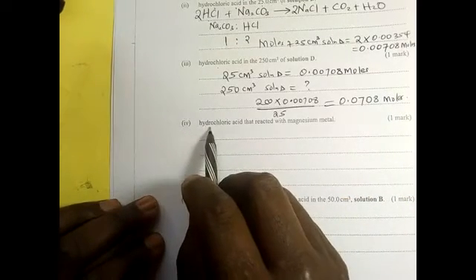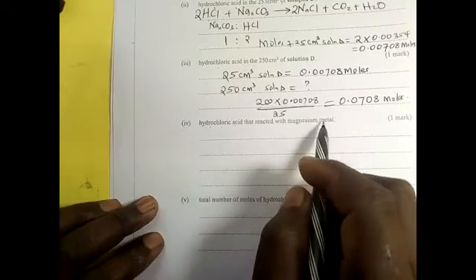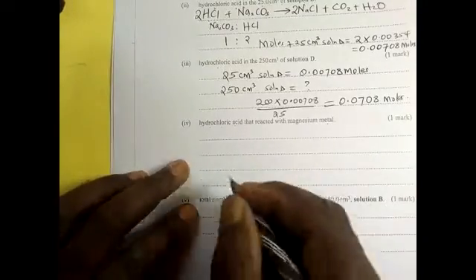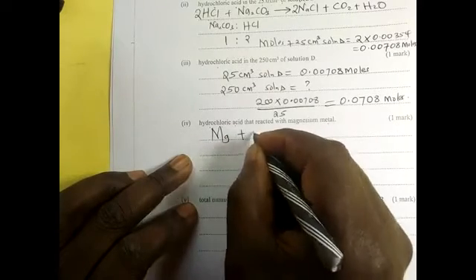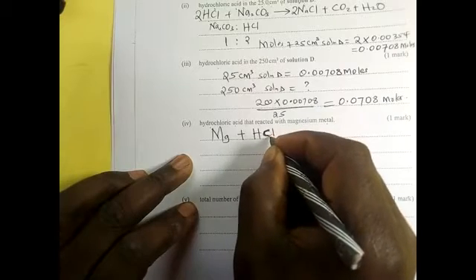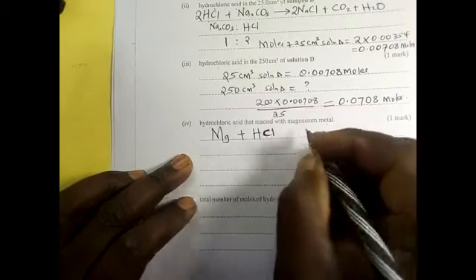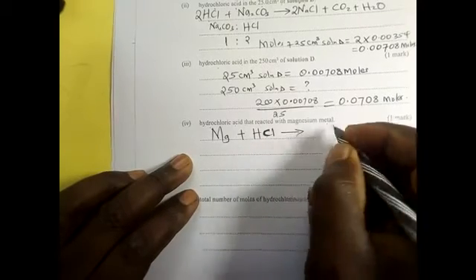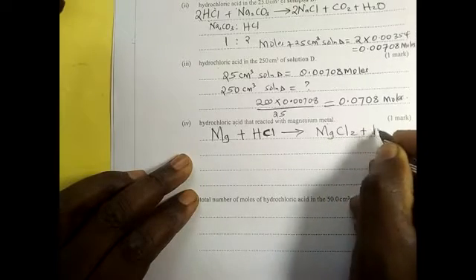Calculate the number of moles of hydrochloric acid that reacted with magnesium metal. Okay, magnesium reacted with HCl, solution B now. Remember, this is the number of moles of solution B, because solution B reacted with magnesium to form magnesium chloride plus hydrogen gas.